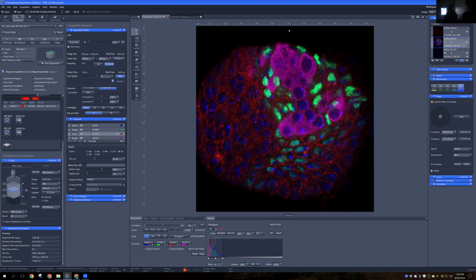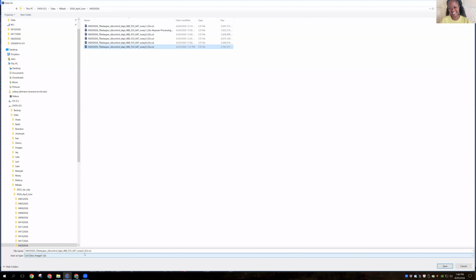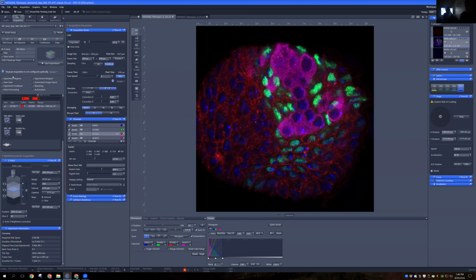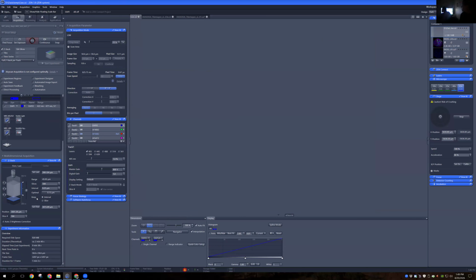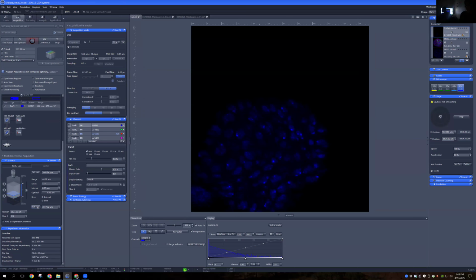Yeah, and I do think a really interesting difference that Raja, you already brought up is, and correct me if I'm wrong, but with astronomy, manipulating your samples is generally not something that you are doing. No, it's not. Whereas in biology, that is at the core of biology. When Michaela first sets up her imaging today, the first thing that she always does is image her control sample so that she understands the system that she has manipulated is behaving as she would expect. And what she's actually imaging right now is a sample where she's changed some variable that she then compares to her control sample.